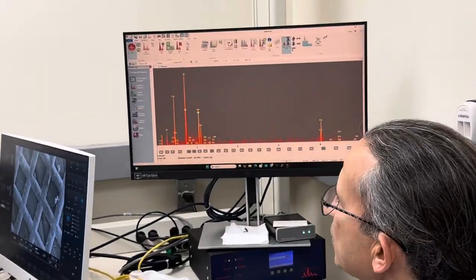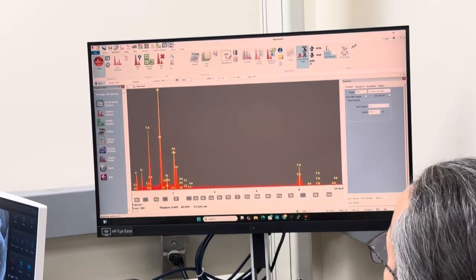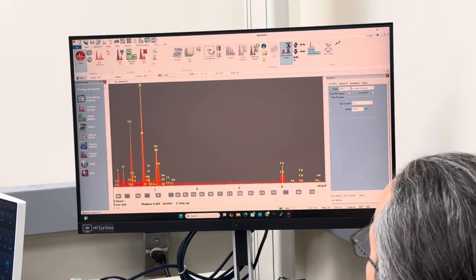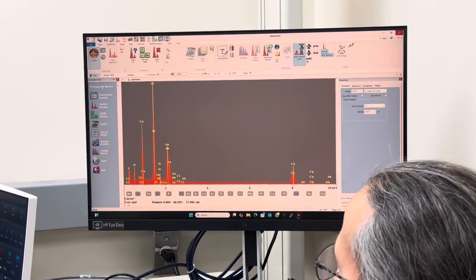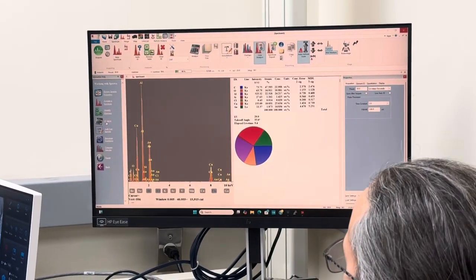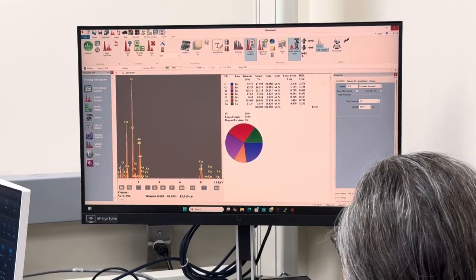That was the initial properties window that said review spectra properties that I ignored, right? So that initial properties window was that. And I just went to the display property. So, let me stop that again. And so we went to analyze, right? That's what we did. And so now I can get rid of this properties window.